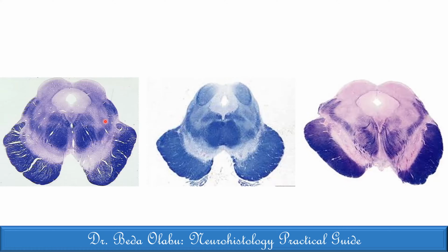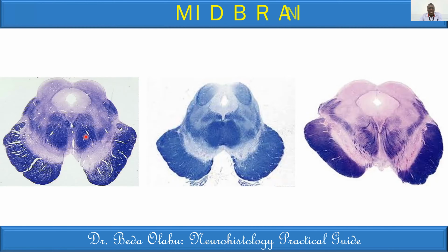And then I'm not sure whether you can see it, this is the red nucleus, but with that, it becomes the brainstem histology. All right, thank you very much. So it's brainstem, I agree with you, but more specifically, midbrain. Midbrain, yes. So yeah, I agree with you, Liz, thank you.